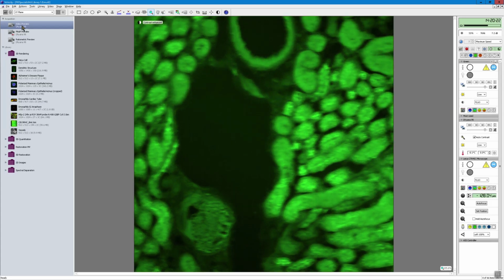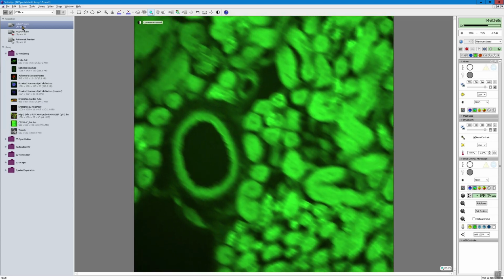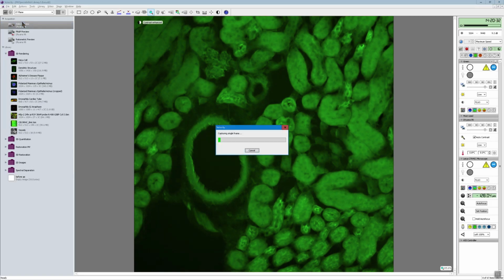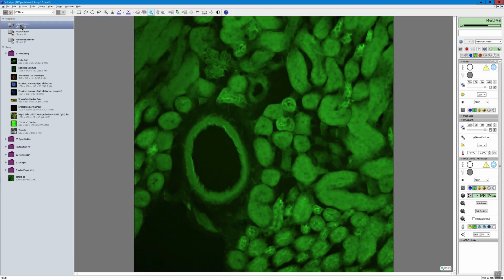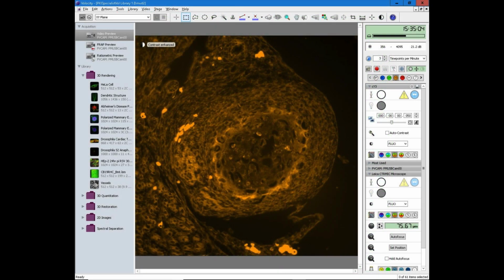This video preview is, by default, active, so that you can quickly review captured images and then choose an appropriate field for your next acquisition. One of the most convenient aspects of Volocity is the capture of a single frame, which can be done by simply tapping the spacebar, and the image in the video is added to the bottom of the library. While this most basic aspect of the Volocity acquisition is useful, most acquisitions will be more complex, so we will review this process as well as the workflow through to image processing, analysis, and presentation.